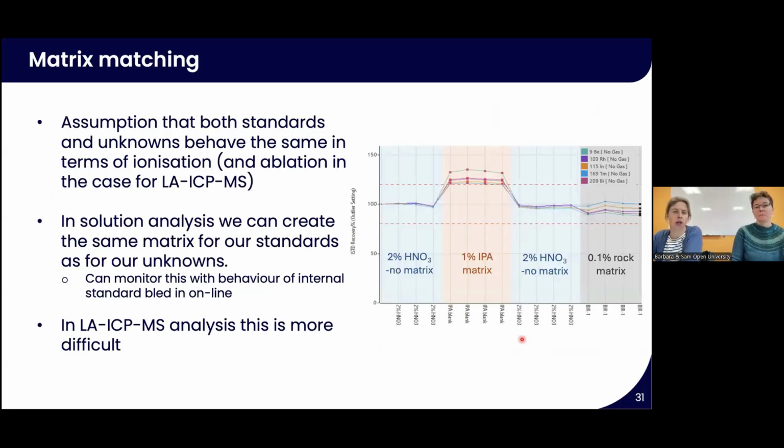So yeah, a little bit about matrix matching, because we've spoken about this briefly on the last few slides. As Barbara said, we make the assumption that both our calibration standards and our unknowns behave in the same way in the plasma, in terms of ionization and, in the case of laser ablation, in terms of ablation.